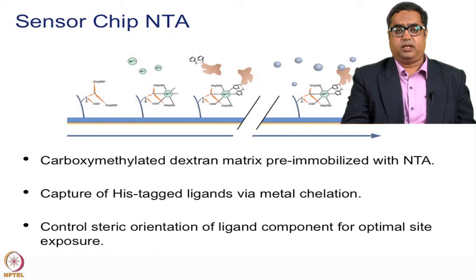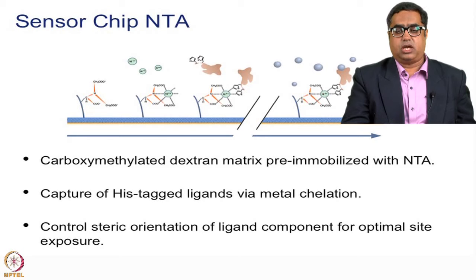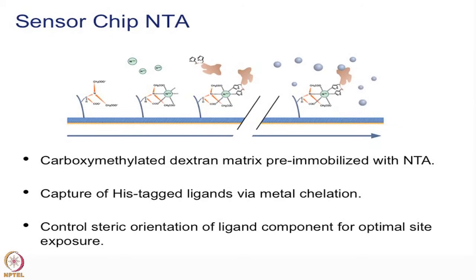So proteins, when they are recombinantly expressed with these tags, have been captured on NTA surfaces for interactions with other analytes, either proteins or complex molecules. These histidine tagged molecules bind to NTA when the NTA is charged with nickel solutions or copper solutions. And these molecules generally help to control the steric orientation of the ligand for optimal exposure of your ligand.